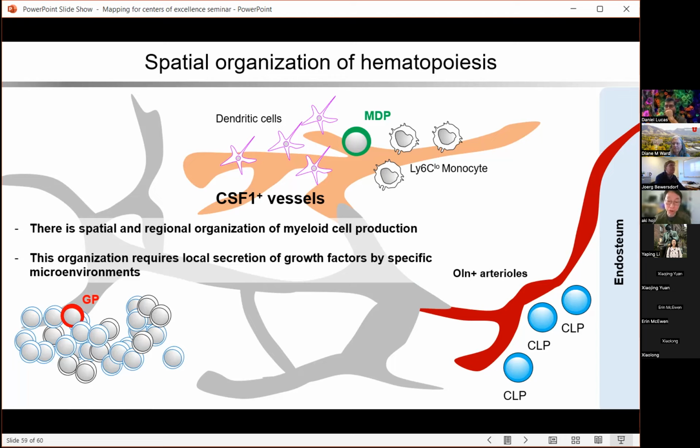So you guys talked about the Akoya system. With the latest PhenoCycler and the PhenoImagers, you cannot do the 3D imaging that you did by confocal, correct? I think you can only do the 2-dimensional image.